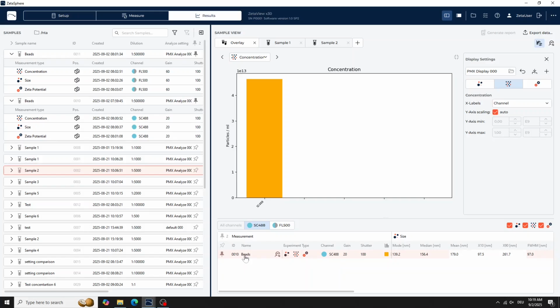Need to fine-tune or revisit a dataset? Click on Analyze Settings to reprocess your data. This is useful if you want to apply different filters by recalibrating thresholds.